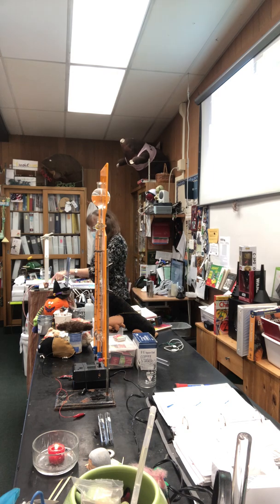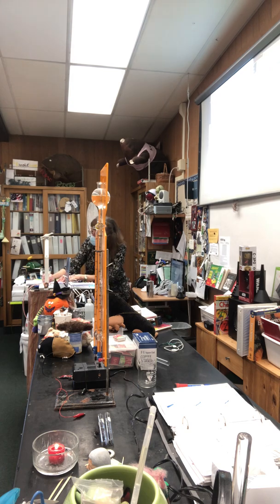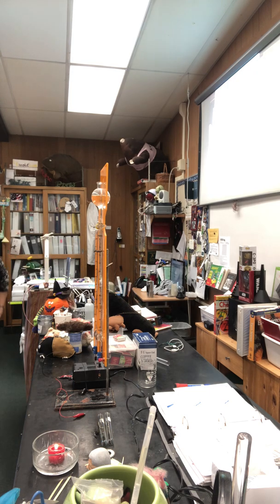Okay, so we've got solution, electrolyte. The electrolyte is sulfuric acid, very dilute. So there's a little bit of charged particles to allow the electric current to flow. Up at the top again are these valves that I'm going to open up later to capture the gas that's going to form. So this thing's going to run for a bit, and we're going to produce gas in these tubes. So I'm going to go ahead and turn it on.